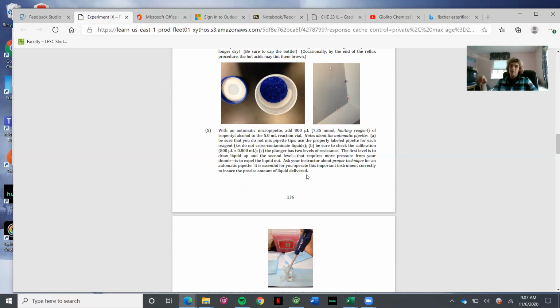And acetic acid is what? We know vinegar. So vinegar is 5% acetic acid, and the other 95 is just water. So acetic acid can take on water and likes to take on water. And vinegar has a strong scent, and only 5% of that is acetic acid. So you guys will be using 95 to 99 percent acetic acid, which we call glacial acetic acid. Because when acetic acid is pure, it freezes at a pretty high temperature, around 16 degrees Celsius, and freezes into a solid block like a mini glacier.